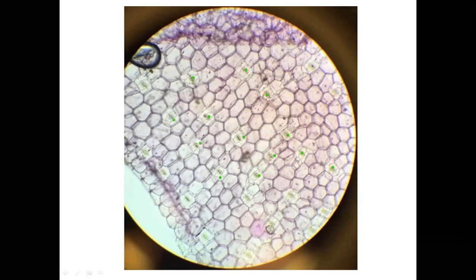And the reason why sometimes this kind of a question becomes a challenge is because you are supposed to move from low power to high power as instructed. If an examiner wants you to count using low power, you should now remember that you are likely to get a higher number of stomata.